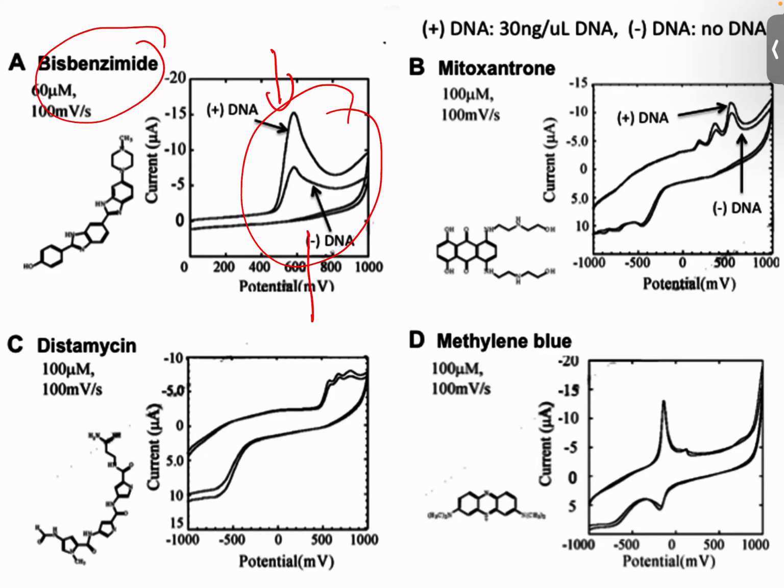And if we have a lower amount of hybridization, then we have a low reading. So this is how the groove binders work. And this is, of course, indicating a negative sample, and probably this is indicating a positive sample. But a lot of work has to be done before we can confirm using this.